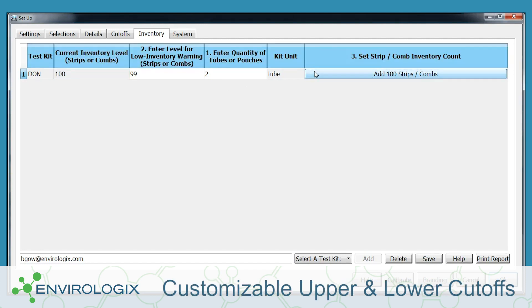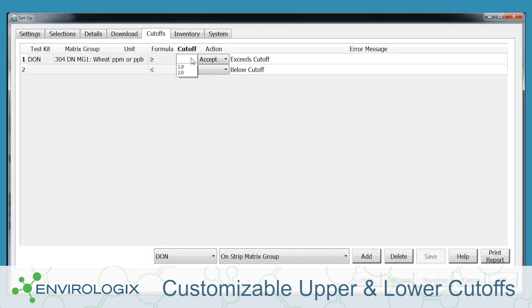The cutoffs function allows you to set actions for both upper and lower limits, and more importantly, you can now customize limits and actions for each matrix group within a test.